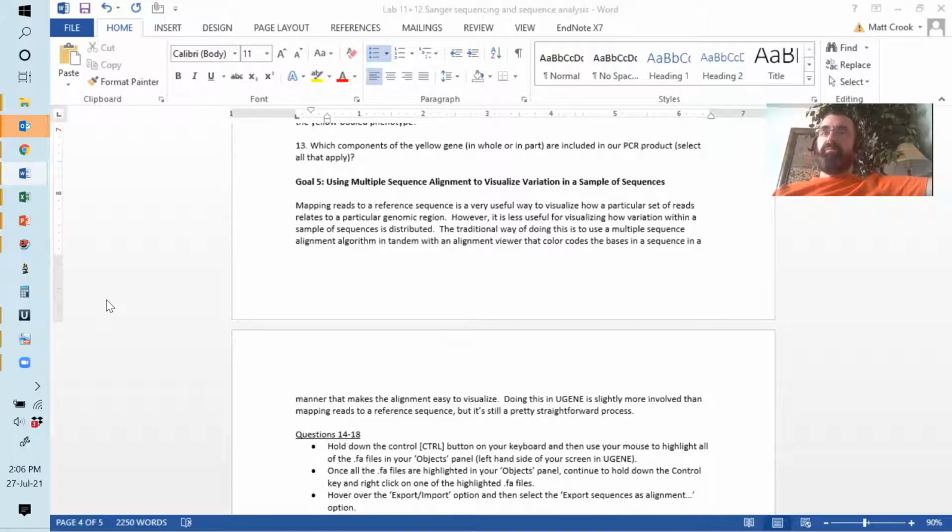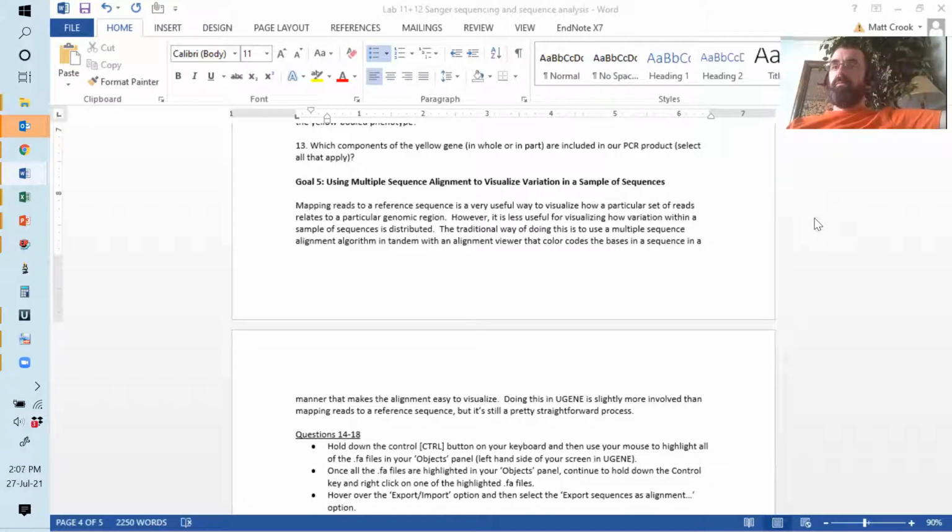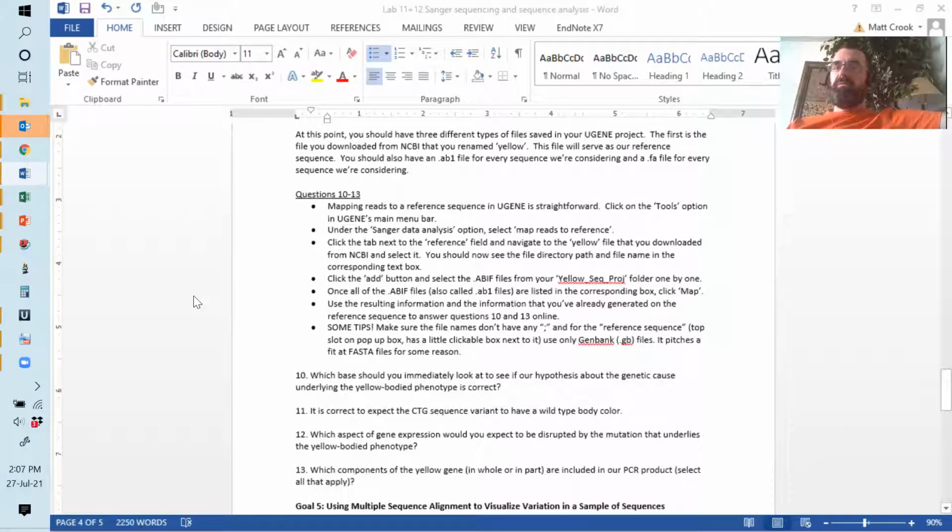Okay, so I don't know if I'm doing this right. I can't remember which step it is because I haven't closed it ever since then because I'm scared to. Yeah, me neither. But I'm at the part where it has, I guess, the coding for the yellow, and it has a whole bunch of coding sequences with different colors. Have you mapped the sequence reads? That sounds like you've already done that step. I'm not sure.